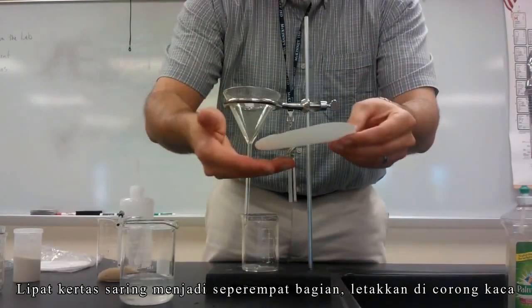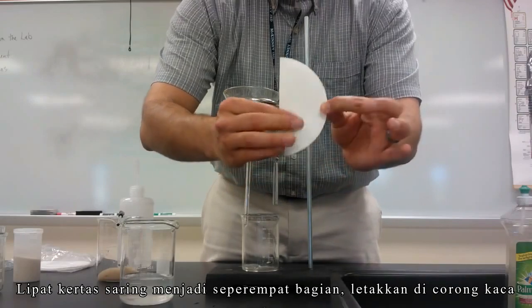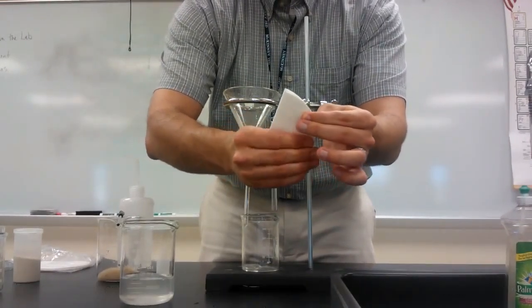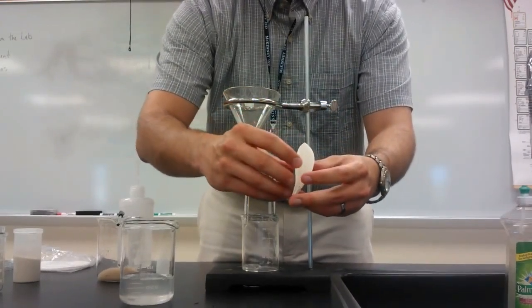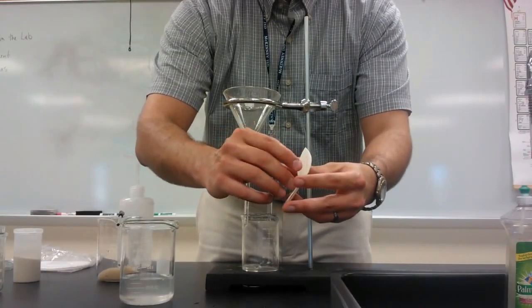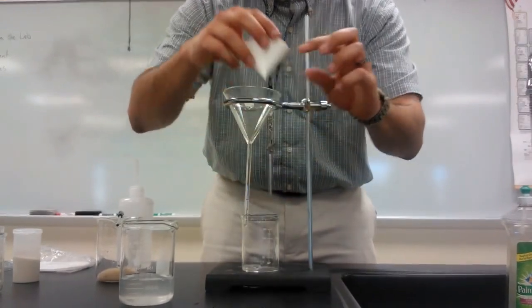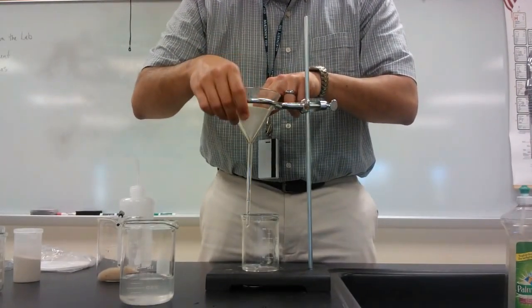Now I'm going to fold my filter paper into quarters. I folded it in half, and I'm going to fold it in half again. What I've got is three layers. I'm going to take the first layer — notice that it will give me a good cone shape. I just open it and it gives me a cone shape, a funnel shape, and I'm going to place it in the glass funnel and press it gently against it.